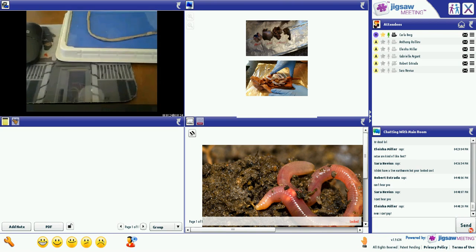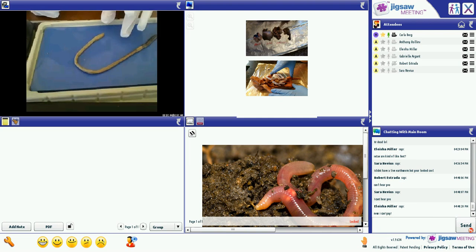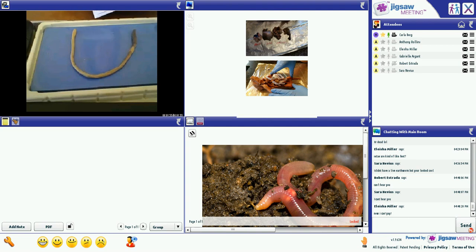And here is my earthworm. Hopefully you can see him. Alright, there is my earthworm. Now I have him kind of twisted so that you can see the whole thing. So, we are on page number 115 of your kit.